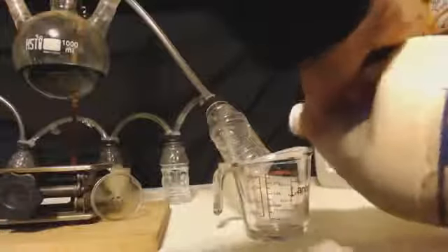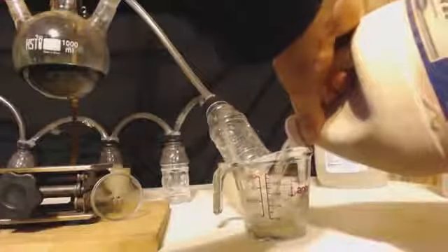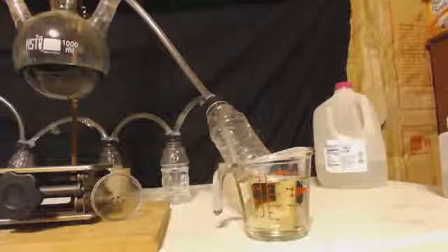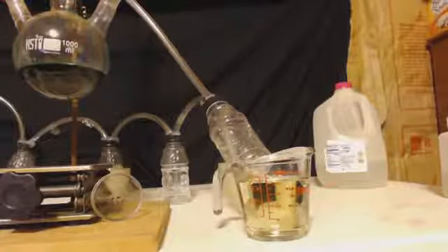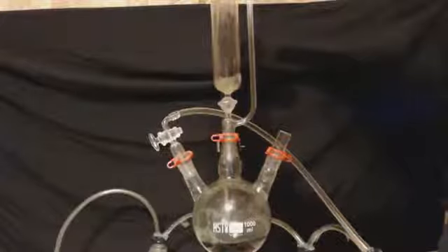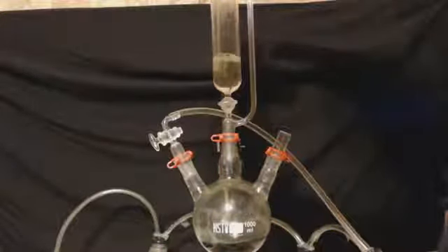Now, I told you I needed 3 moles. I only put in 2 moles of HCl, so I'm going to put in another 2. That'll be an extra mole. And if you think about it, I probably need more than that because the first 2 moles are going to be reacted, and I'm only going to have water. All that HCl is going to be gone. And so I'm really going to have dilute HCl, hydrochloric acid, when I put this in and it mixes together. It's not going to be very strong.